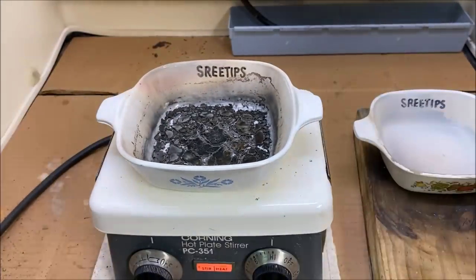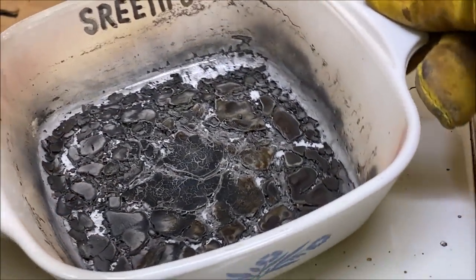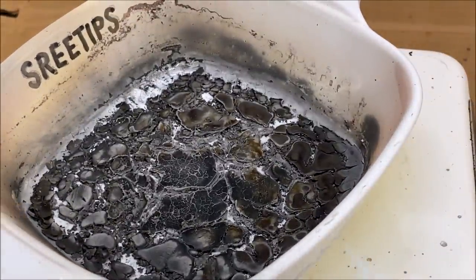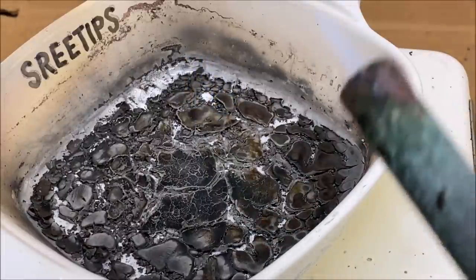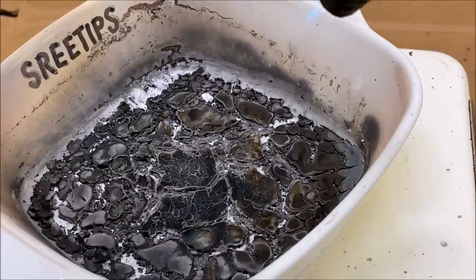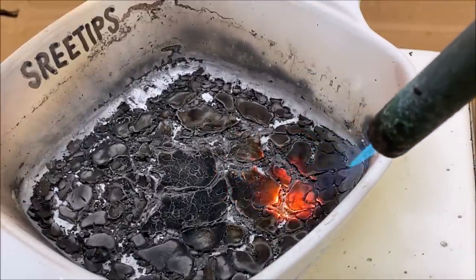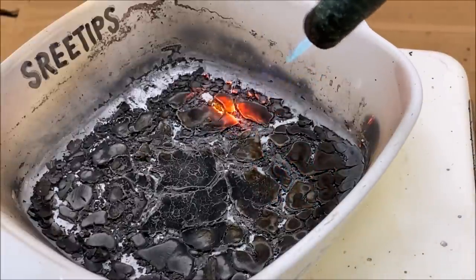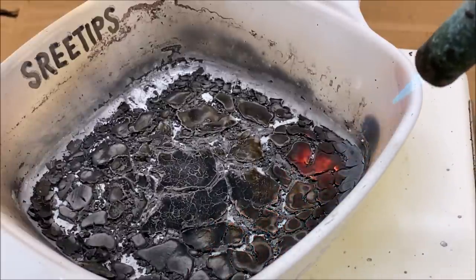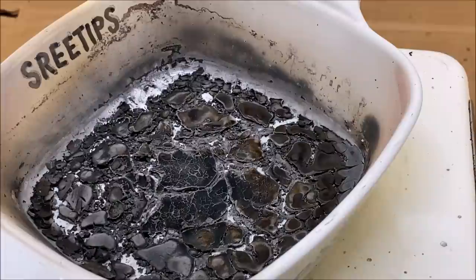I'm gonna heat it back up. I've got this heated up now, so it's not ice cold. What I'm gonna try to do is, I have a propane torch here with the heat down just as low as I can get it so I don't blow this stuff around. Now what we're gonna try to do is heat these pieces up. And I think I see any change in color, so I think we may have it here.